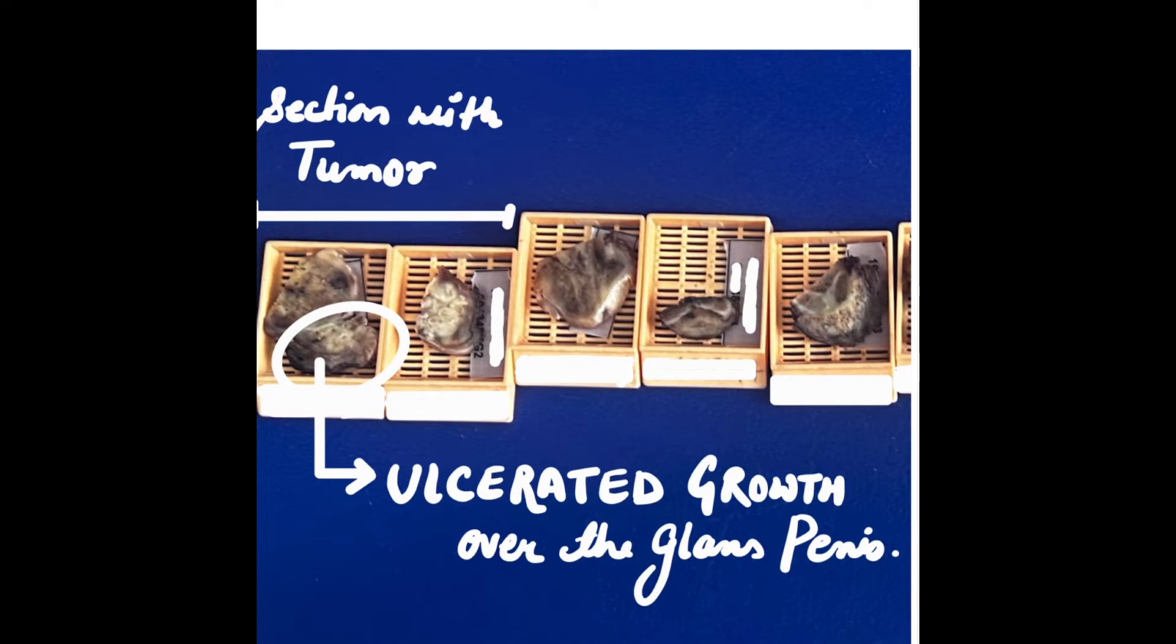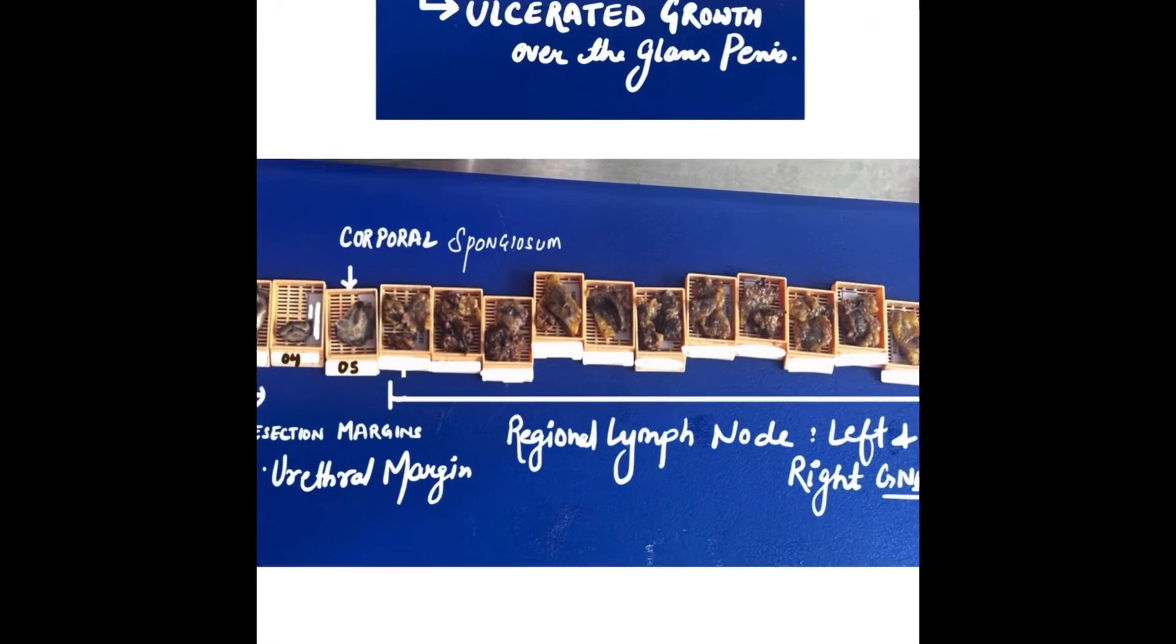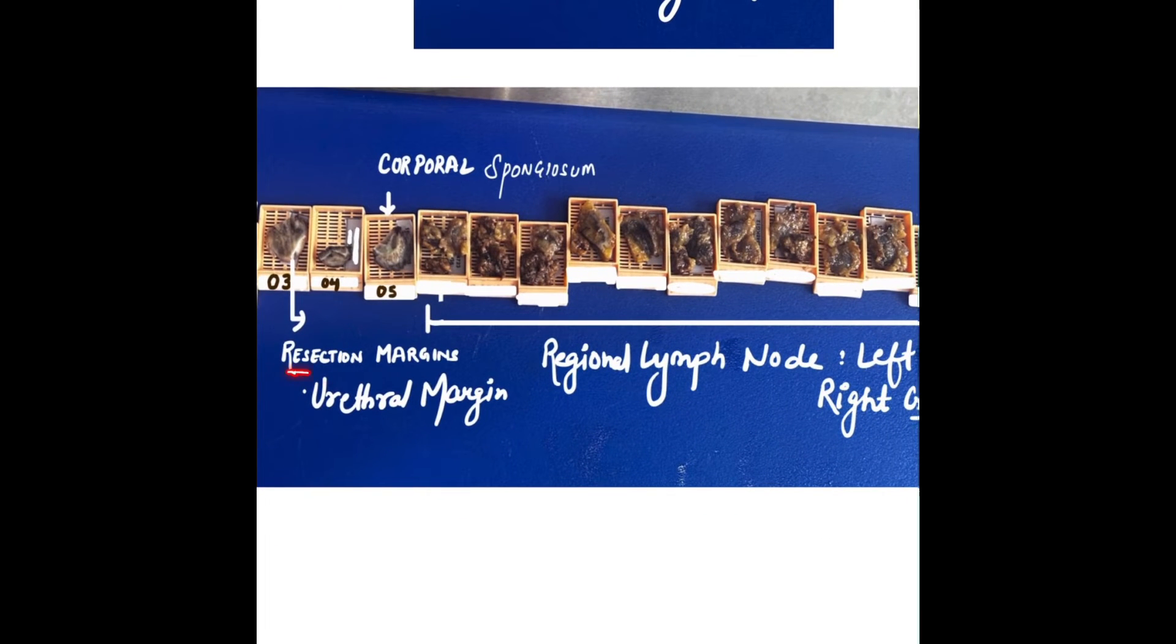Cassettes one and two are sections with the tumor. Here it is—the ulcerated growth over the glans penis. I mentioned the resection margins in cassettes three, four, and five.